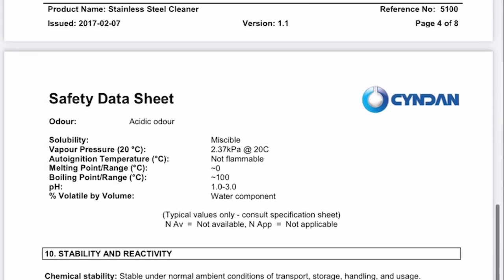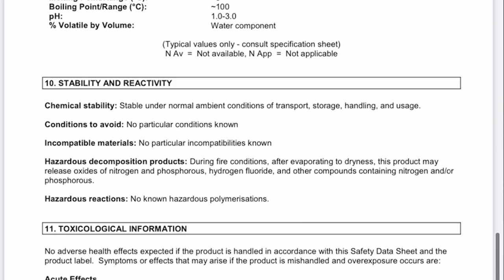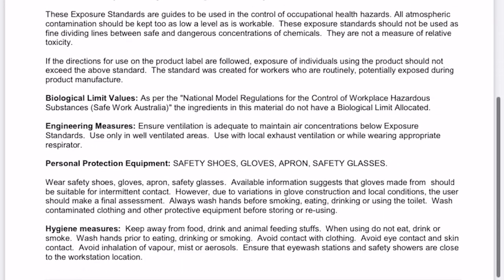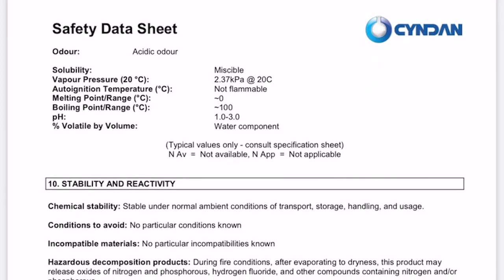If you find that a chemical spill has occurred in the sump of your corrosive cabinet, you should refer to the SDS that's located nearby your store. Check for information on what cleaning materials are compatible with the chemical in question, what PPE is necessary, and the chemical's pH level to see if an acid neutraliser is required.